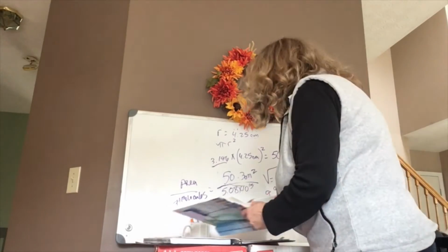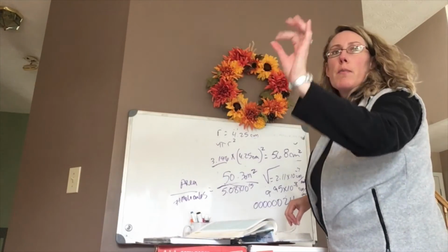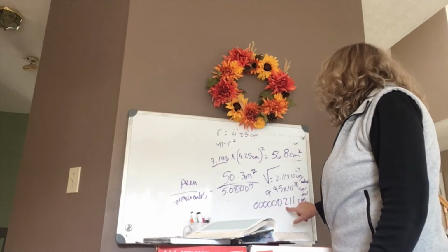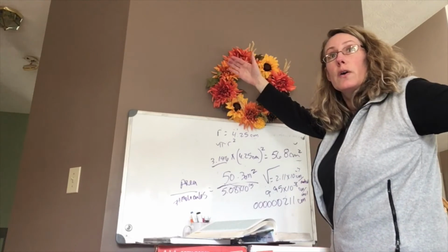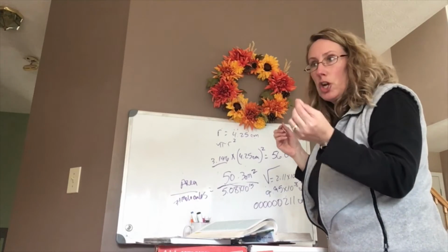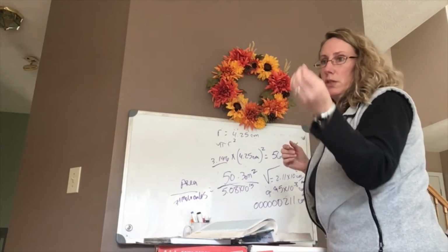There you go. This is your conclusion. Please have this in your conclusion. What did you learn? This is how big my molecule is. Is it big? No, it's very small. Now that seems like such an insignificant thing to learn after all that math, right? We proved that a molecule is really small.